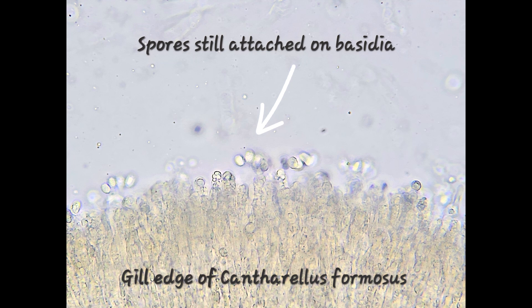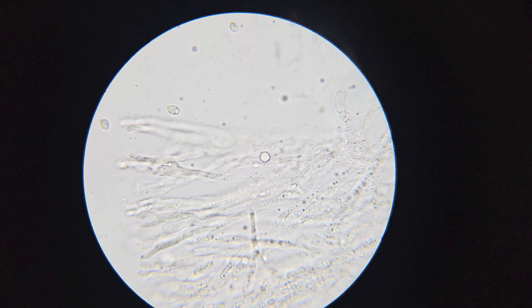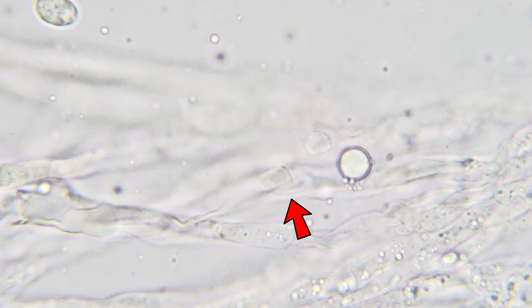As we go to this next picture and look kind of close, we can see the hyphae — those are the actual strands of fungus. I was looking for something called a clamp connection and I think I see one here in this picture. Right there where the red arrow is pointing, it's called a clamp connection. That's where two strands of hyphae are connected — it's basically two chambers in the hyphae that are separated by a structure called a septa, and then just on the edge of the septa is this little structure that connects the two segments. That is called a clamp connection. They often just look like a little bump on the side of the hyphae. In a lot of mycological microscopy literature, it's going to refer to having clamp connections or not.